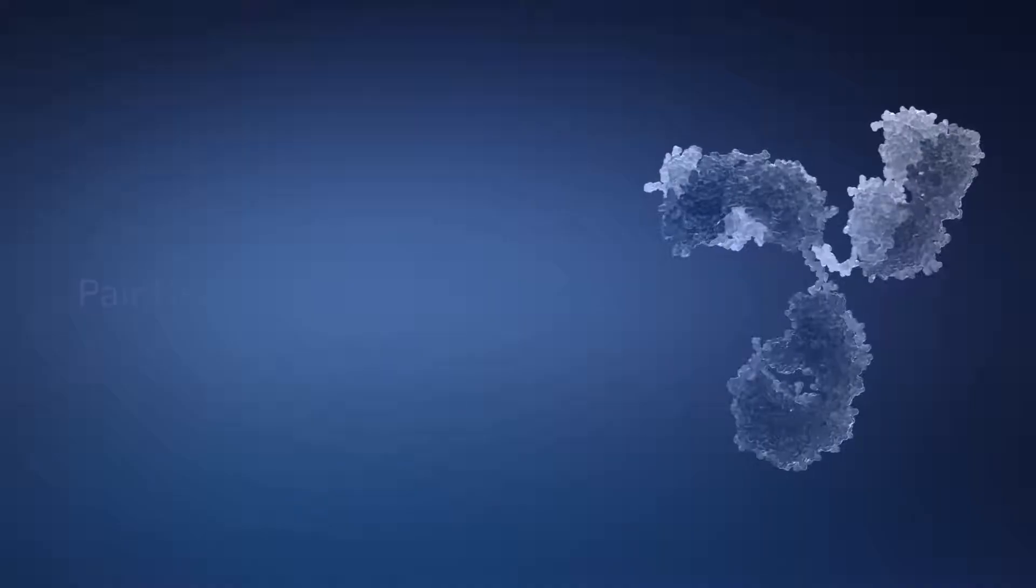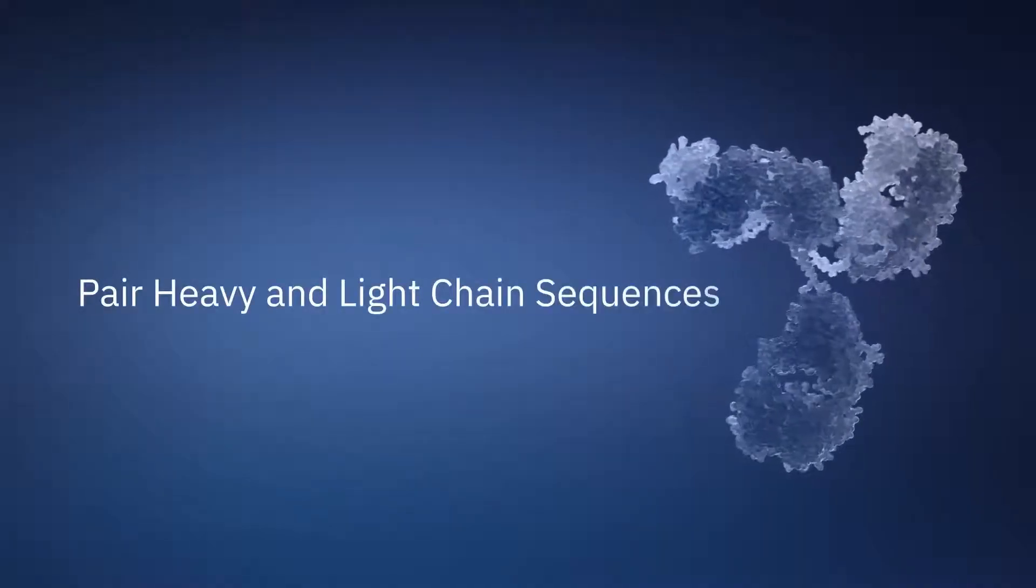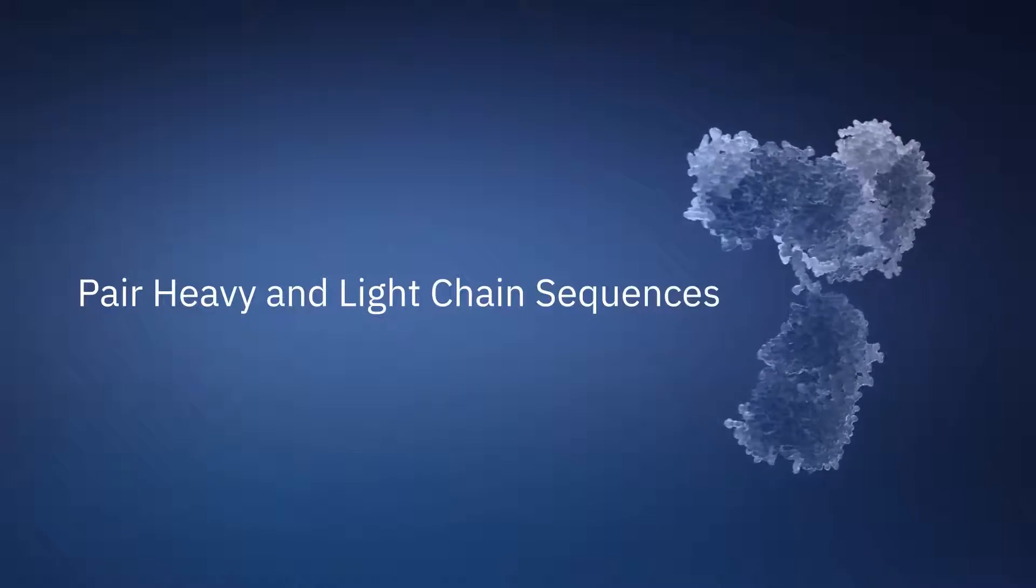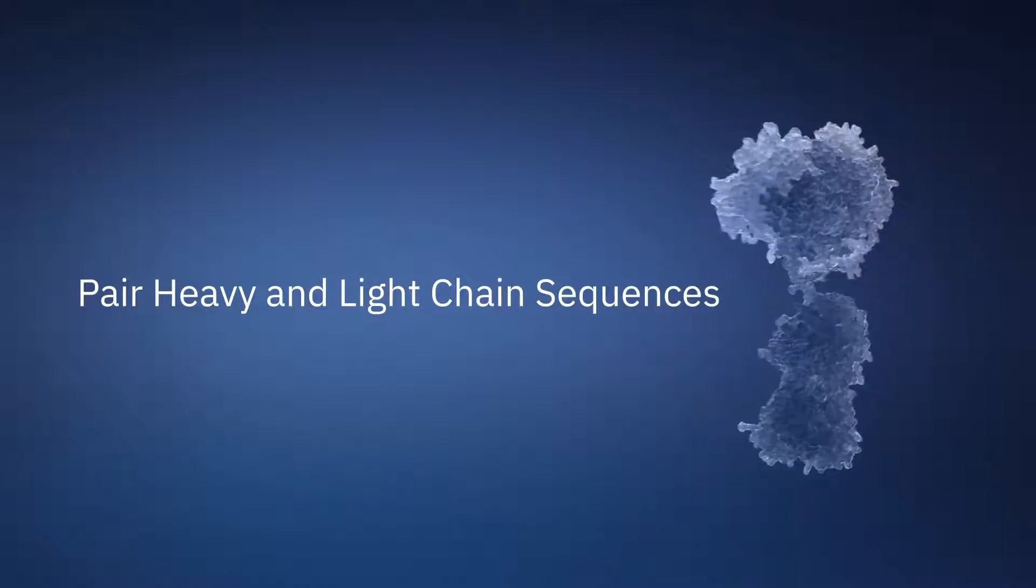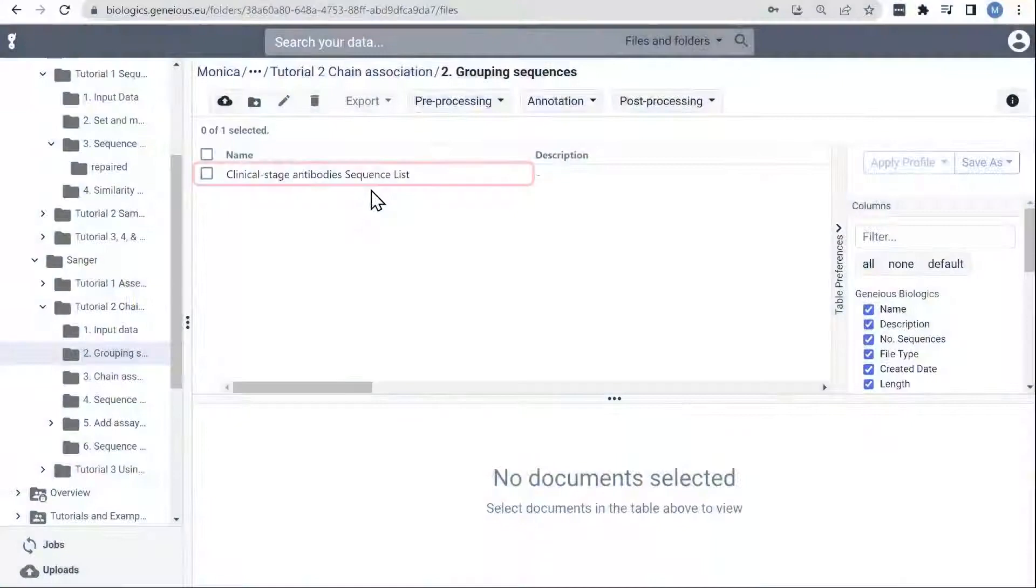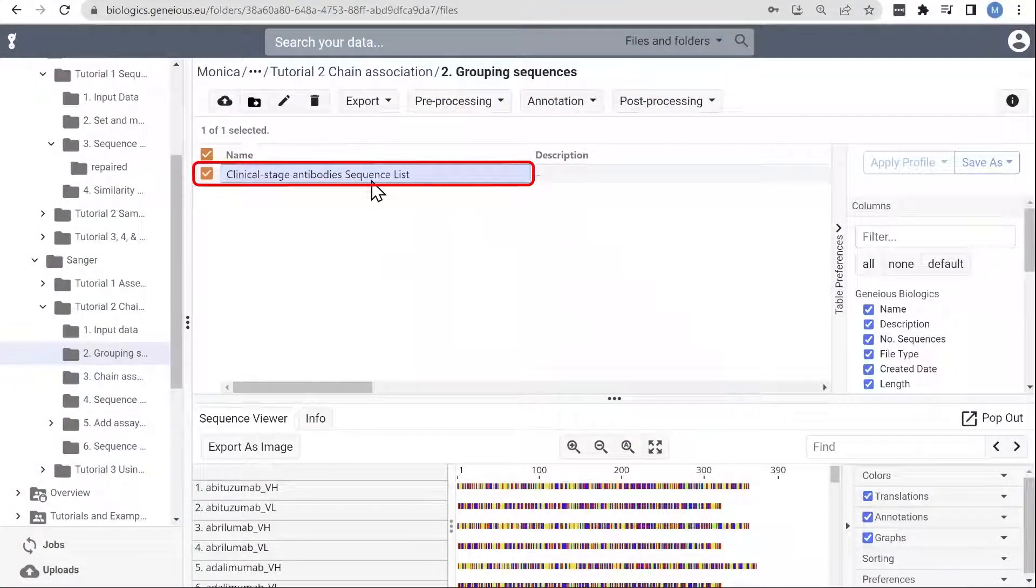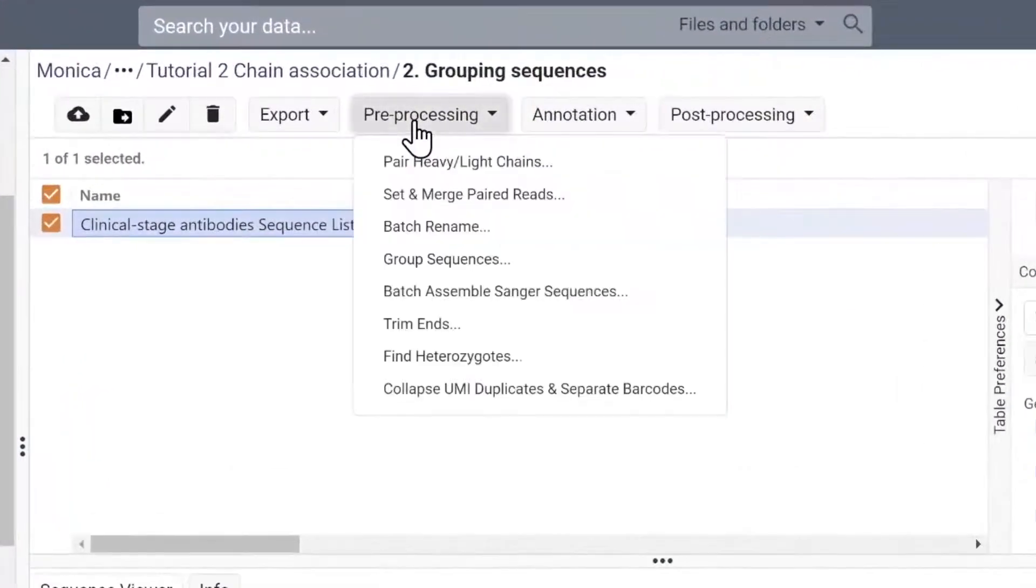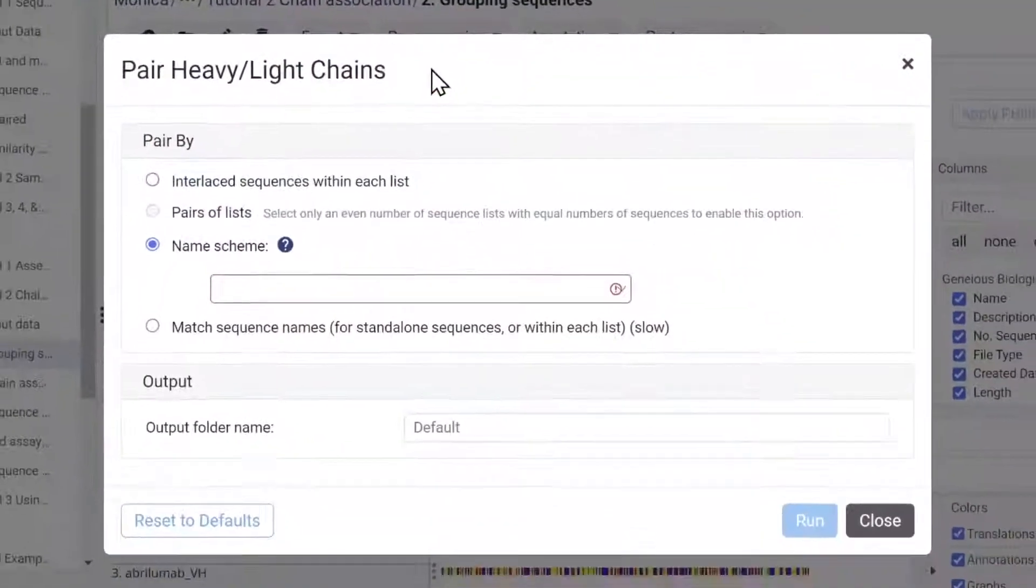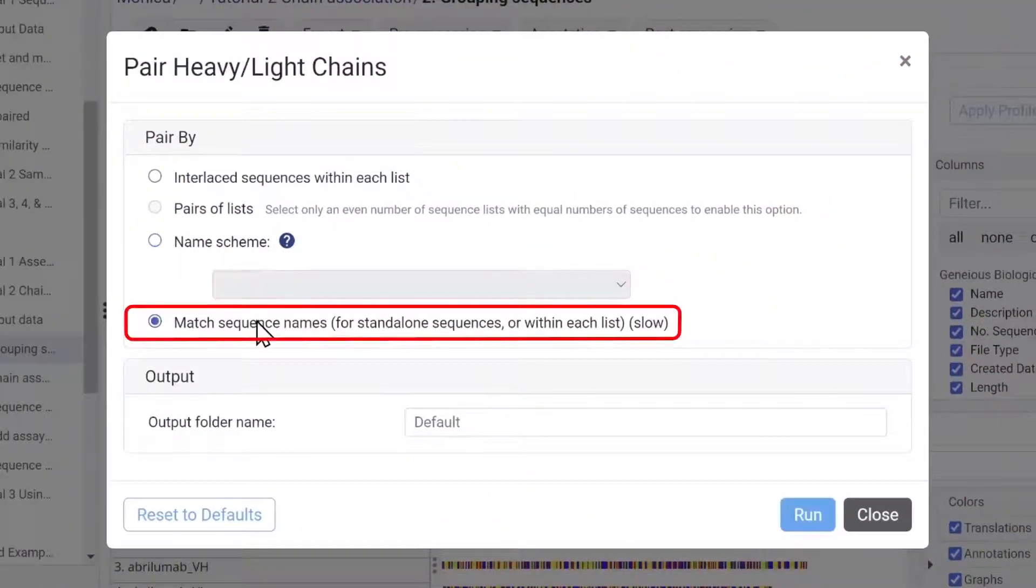Genius Biologics can also pair individual heavy and light chain sequences based on list position or commonality in the sequence name. In this example, you can see that there is a heavy and light chain for each clone. The heavy and light chain sequence names both include the antibody name, so we'll be matching by sequence names.